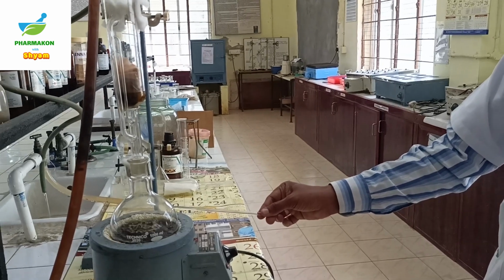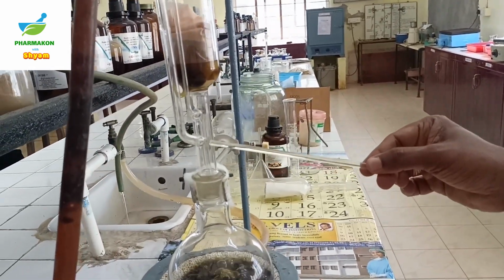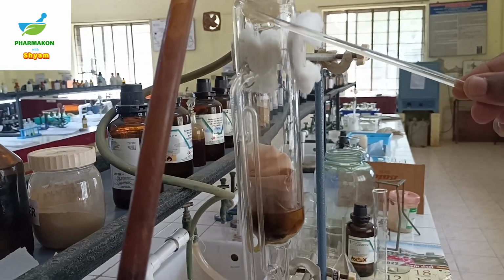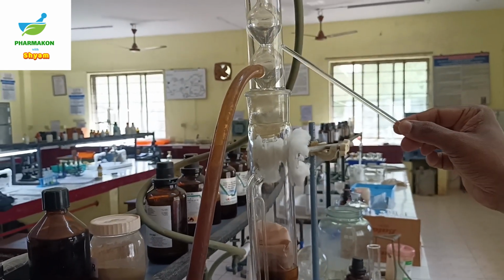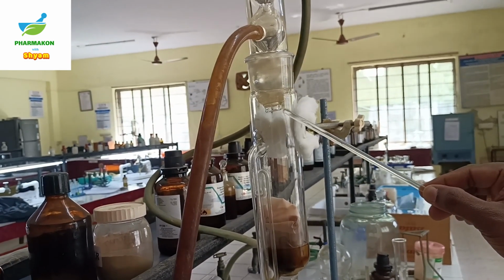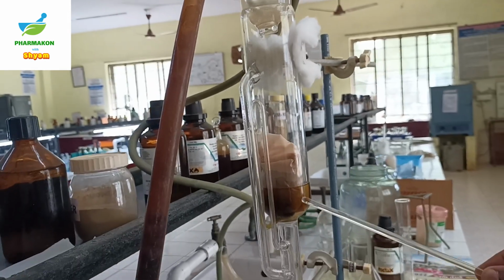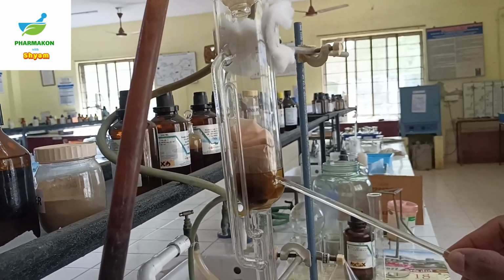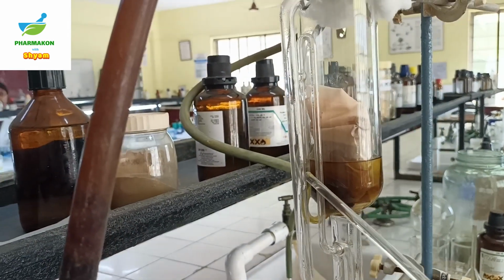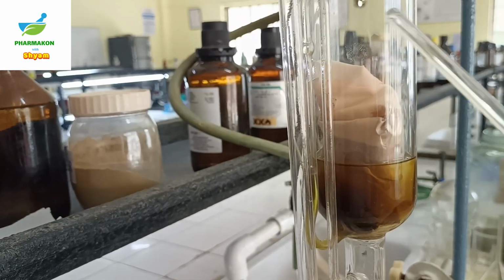The solvent in the round bottom flask starts to boil and gives rise to vapor. The vapor passes through the vapor tube, moves upwards and reaches the condenser. Upon reaching the condenser, the vapor is turned back into droplets. You can see the liquid droplets flowing back into the extractor. Also, the level of the solvent rises in the extractor, and parallelly the level of the solvent in the siphon tube also increases simultaneously.